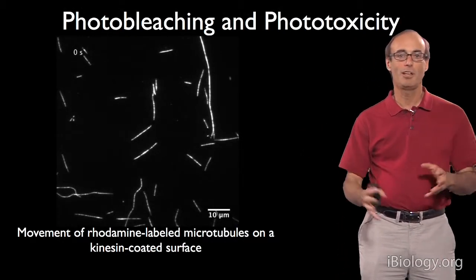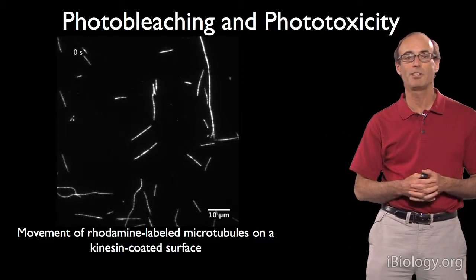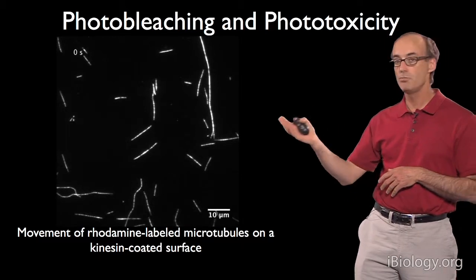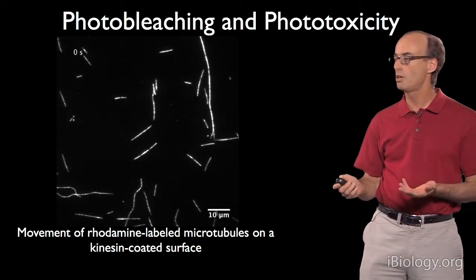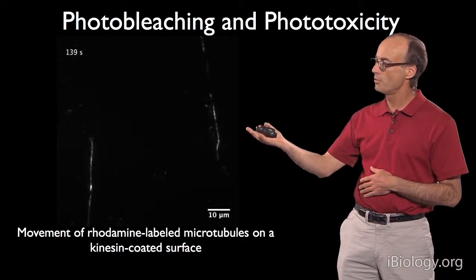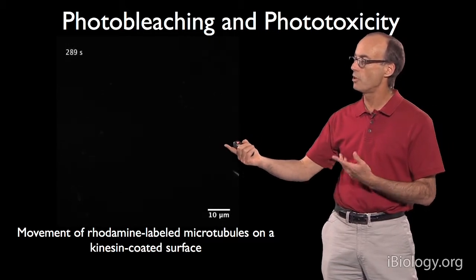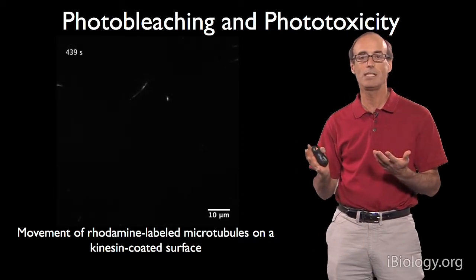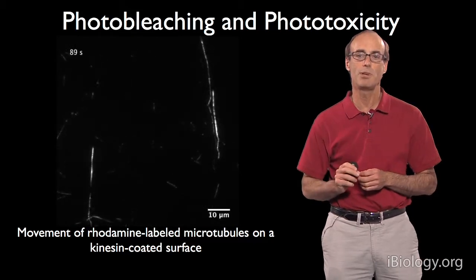Fluorescence microscopy is great, but two of the evil side effects that one often has to manage are photobleaching and phototoxicity. These are illustrated in this movie, where you're watching rhodamine-labeled microtubules moving along a kinesin-coated surface. Over time of illumination, the fluorescence signal begins to get dimmer — that's photobleaching. These microtubules have also become fragmented into many small pieces, and this is phototoxicity, because the illumination is actually destroying and breaking up these microtubules.